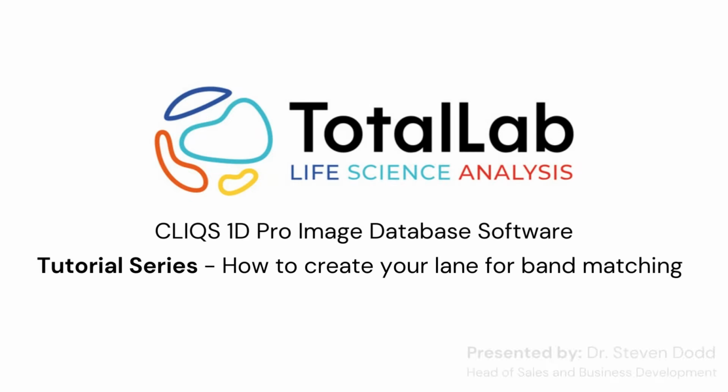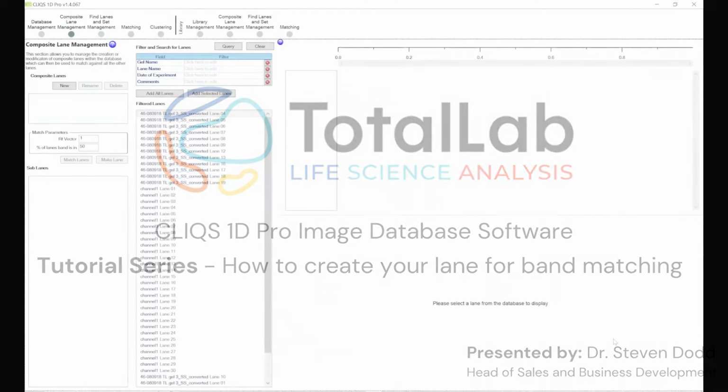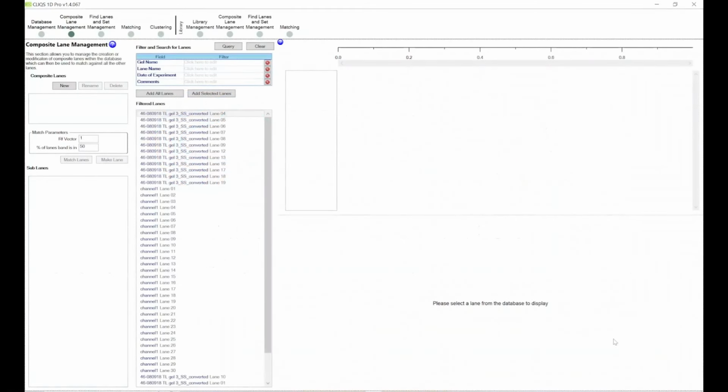Hello everyone. Today I'm going to show you how we define a lane full of the bands that we want to try and compare to our database full of 1D gels and blots. So following on from my previous tutorial video of CLIQS 1D Pro, where I showed you how to bring together all your different images of gels and blots to start forming your database, within the composite lane management section of CLIQS 1D Pro is where you define what you're going to search for within your database, what bands you're going to try and identify matches for within your database.